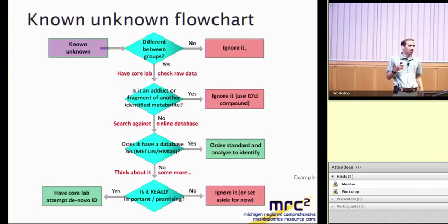The next step that we would usually take is to search it against an online database, something like Metlin or HMDB, even PubChem if you were feeling like not biasing it. Yes? You can do that, right?